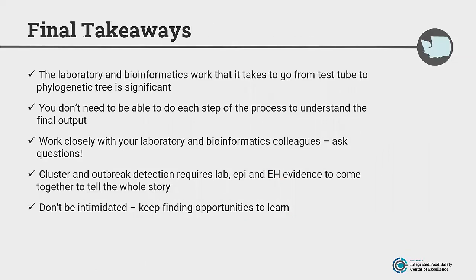So some final takeaways. The laboratory and bioinformatics work that it takes to go from the test tube to the phylogenetic tree is significant. Appreciate your laboratorians, your bioinformaticians, and all the work that they are doing. I know it can be hard to be patient. I think epidemiologists particularly can get excited and want results now, but I hope you have some appreciation of all the steps that it takes to get that final output.